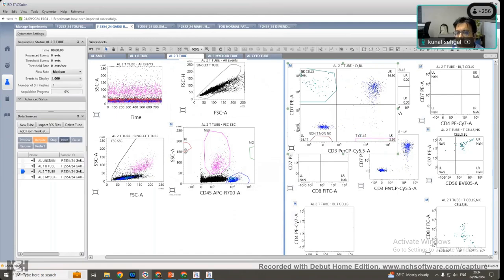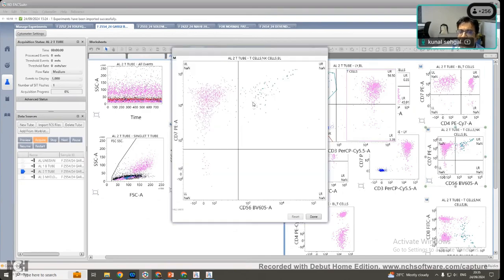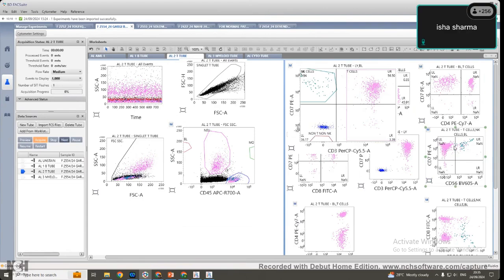It is very easy to say blast positive, blast negative in a very good panel, but how do you know the antibody is there or not? So first, in this population I said show me the lymphocytes, and it showed me the lymphocytes. I color the T lymphocytes pink. I color the NK cells green because I know normal NK cells are CD7 positive, surface CD3 negative. In the previous assay of TBNK, we studied the NK cell markers CD16 and CD56. Can you see the green cells positive? Few of them are CD7 and CD16/56 positive. Are you able to visualize them?